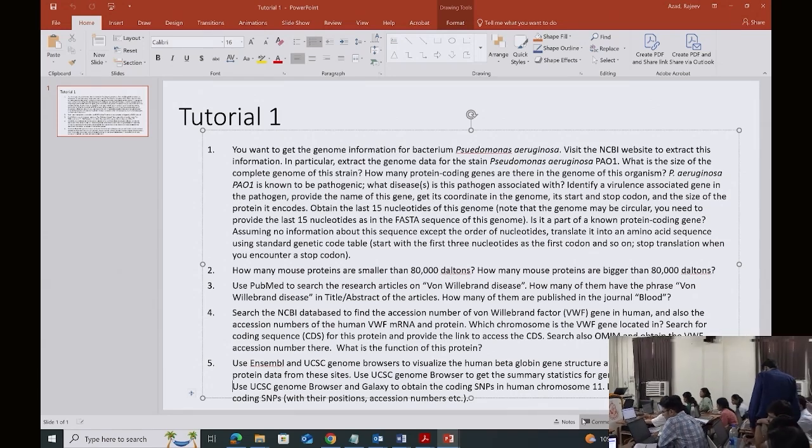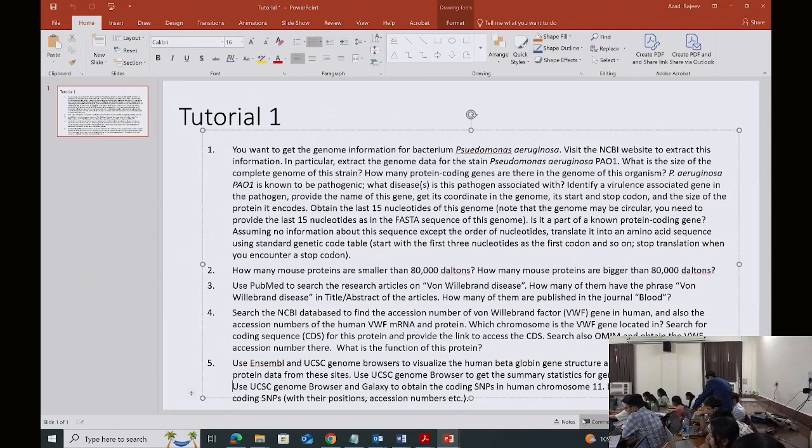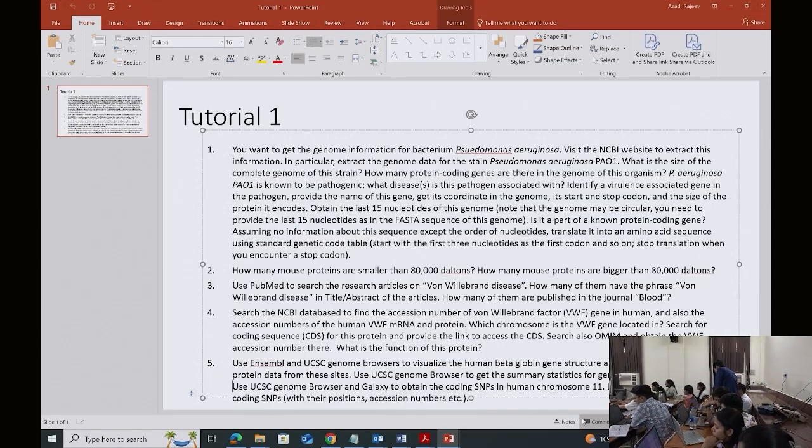In Ensembl, I came till here. Oh, okay, good. So for download, you will just download. It will download in your downloads. Yeah, it is here. In UCSC, I came here. For this HBB. Yeah, right. So you are here. So where is this? Okay.